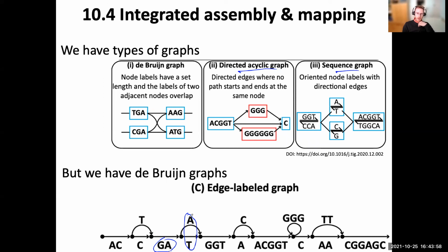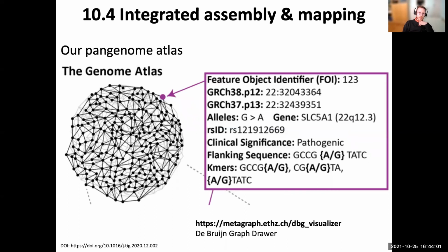And what we can think of is what's called a pangenome. A pangenome is all the genes or DNA regions in a sample collection. So all the samples' genes put together. Theoretically you should get to some point where, if you keep adding more samples, you don't get many more genes, but that is not always the case for bacteria. It depends on the species. So we can think more broadly about how we represent our genome: not as a linear structure, but, more accurately, as a messy ball like this of connected k-mers.